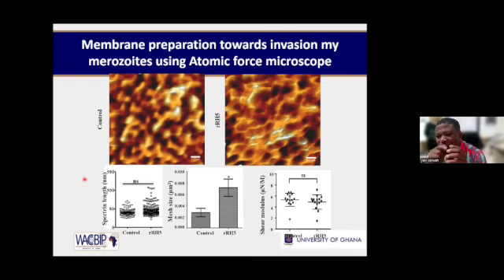The human red blood cell is 8 microns. So basically, you're looking at two relatively small things, though the red blood cell will be easier to see. But how can you really be firm and also be sure of the biology you see? That is why we need imaging, and not just any imaging at all, a higher resolution imaging.